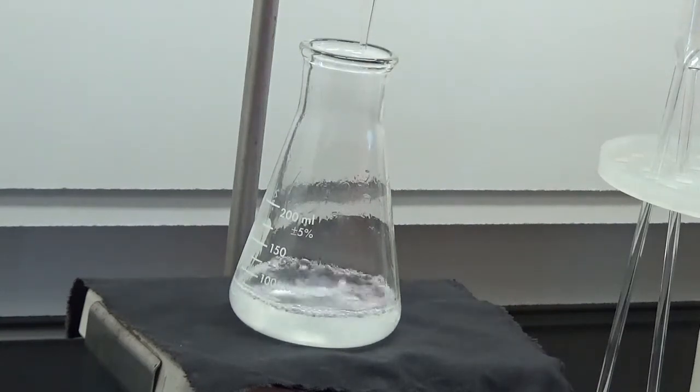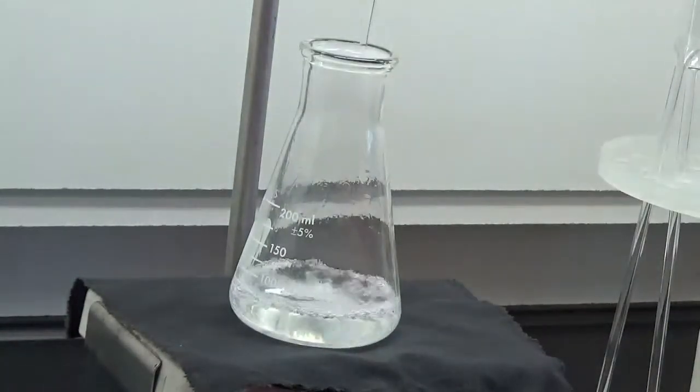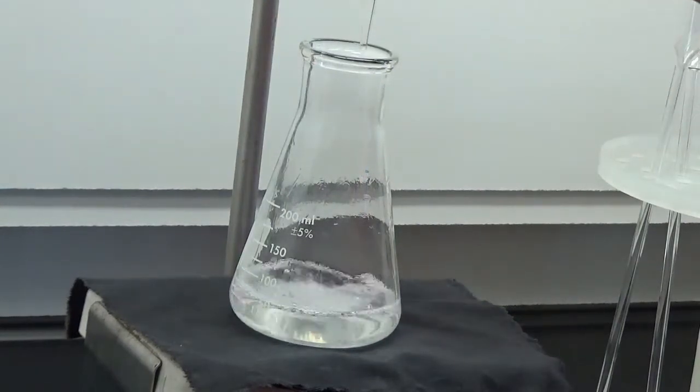Ooh, look at that. Just cleared right up. Almost. Is it really? Huh, I think it's the turbid point. Not sure. Maybe just a little bit quite. Almost. One more drop.